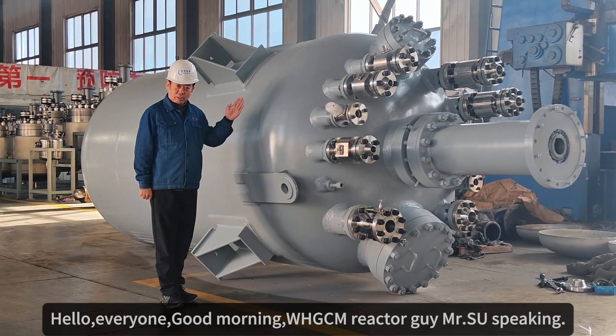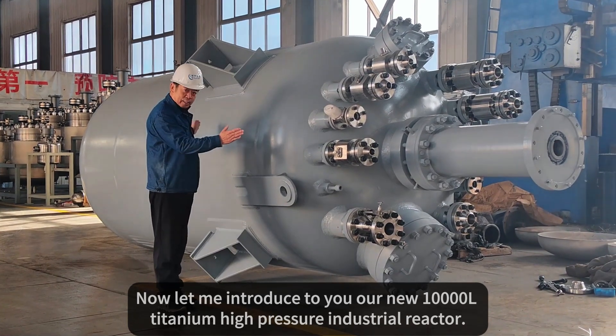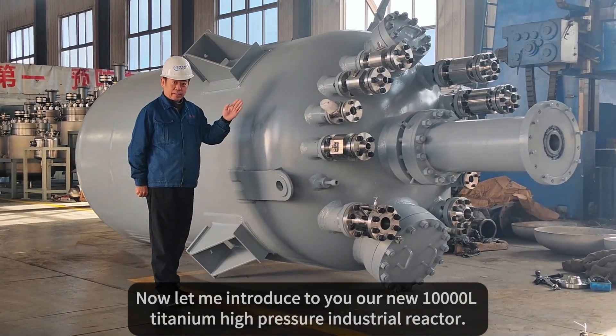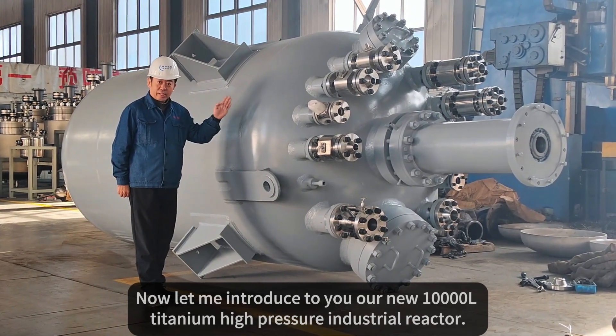Hello everyone, good morning. WHZCM Reactor Guy, Ms. Shu speaking. Now, let me introduce to you our new 10,000L Titanium High Pressure Industrial Reactor.